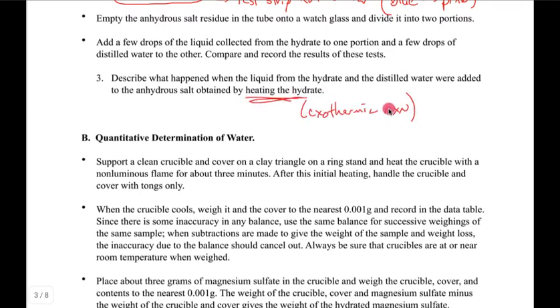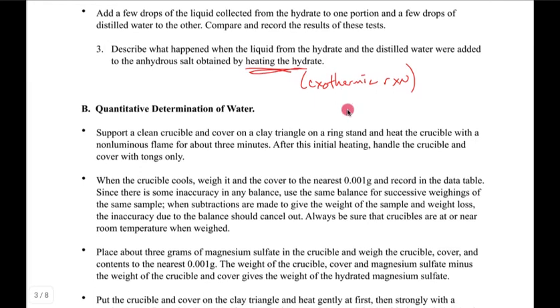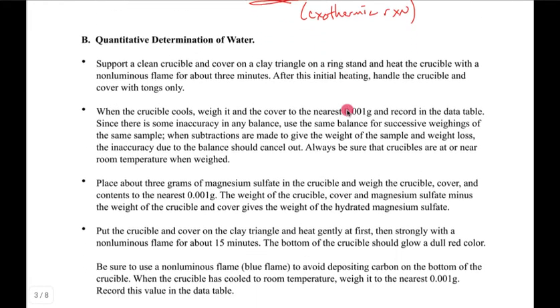It happens very quickly, and it's not obvious, but there's actually some steam that's given off when the water's added to the white powder, and it turns blue. You may not be able to see it in the video. And actually, when you do the experiment, there's a hissing sound with the steam escaping, and that you can't hear. The hoods were going too, it's too loud to be able to hear anything.